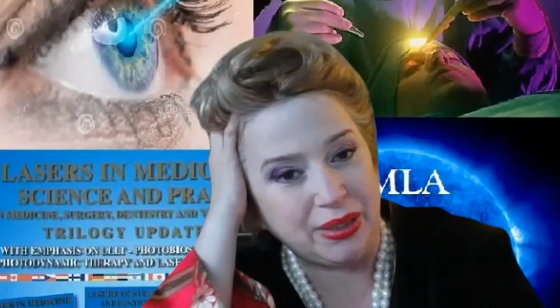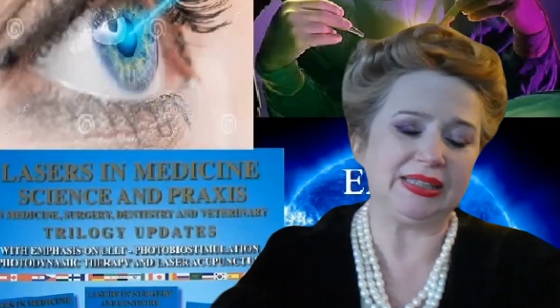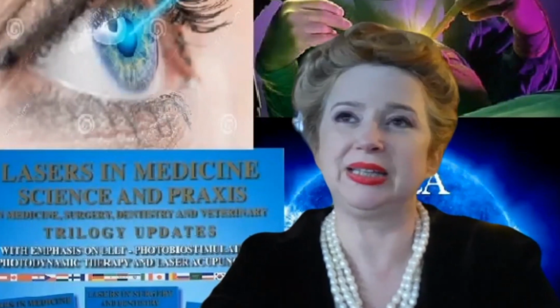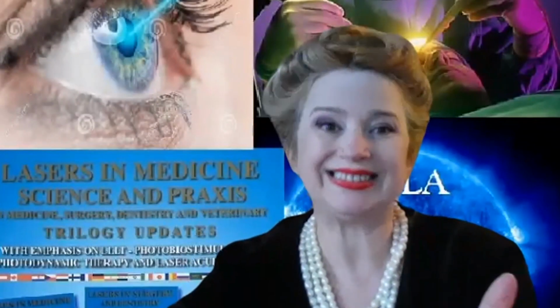So tell me, what level of microscope do you need for your app? How performant? Some settings they might not have. No, we just need any microscope which can have times 100 zoom. That's it. That's great.